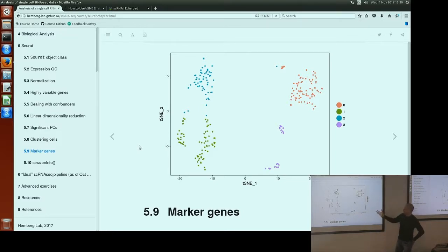But tsne plot, again, is not necessarily showing you the real structure of your data. That's why these clusters look weird on this plot. But as I said, for larger data sets, usually tsne performs better. So when scRAD works on larger data sets, clustering is probably better, and then tsne will represent the structure of your data quite well.